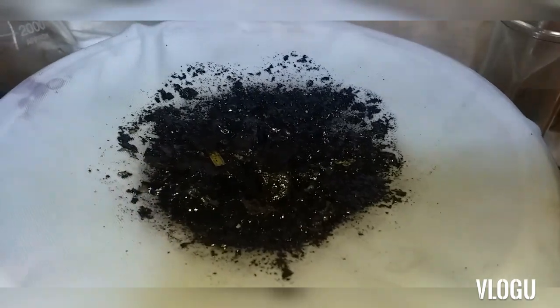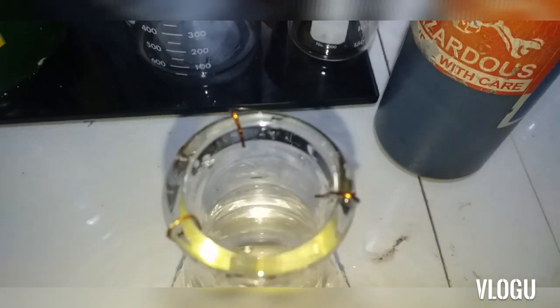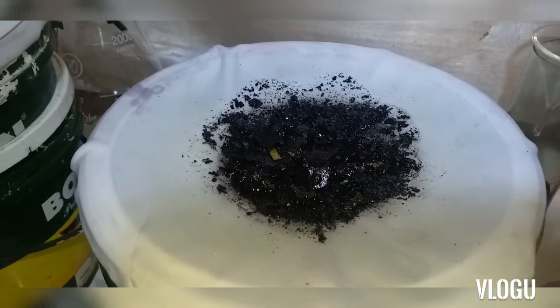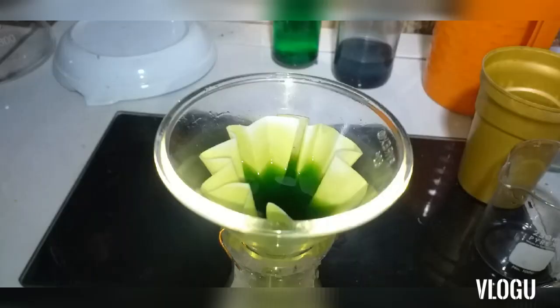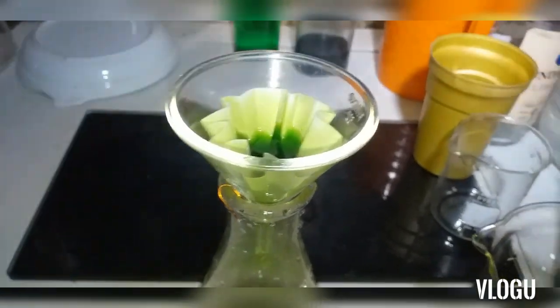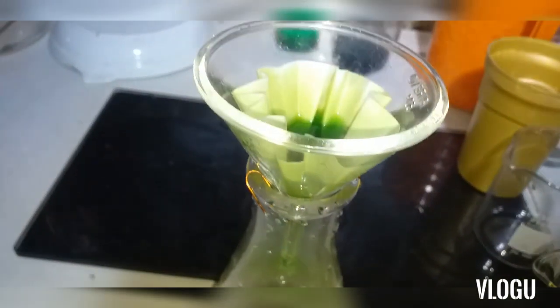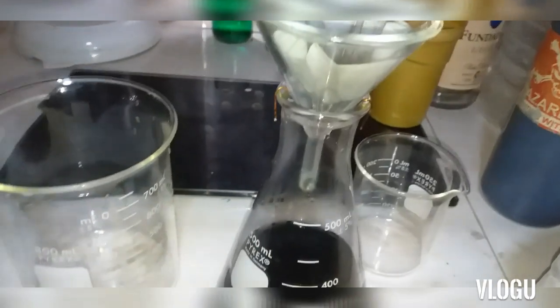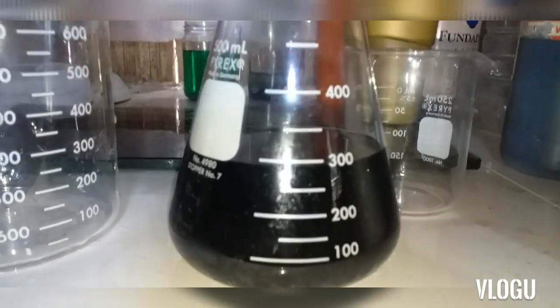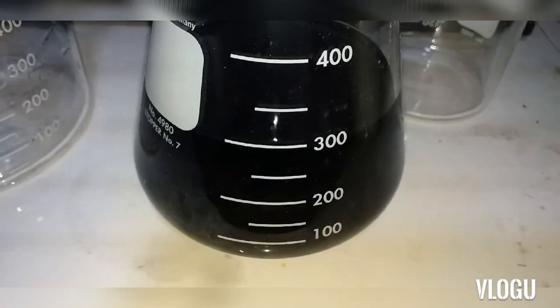This is the best idea to do — to control the filtration with filter paper. My filter paper is a bit small for the funnel, but that's okay. I don't use vacuum. 300 ml of solution — done with filtration.